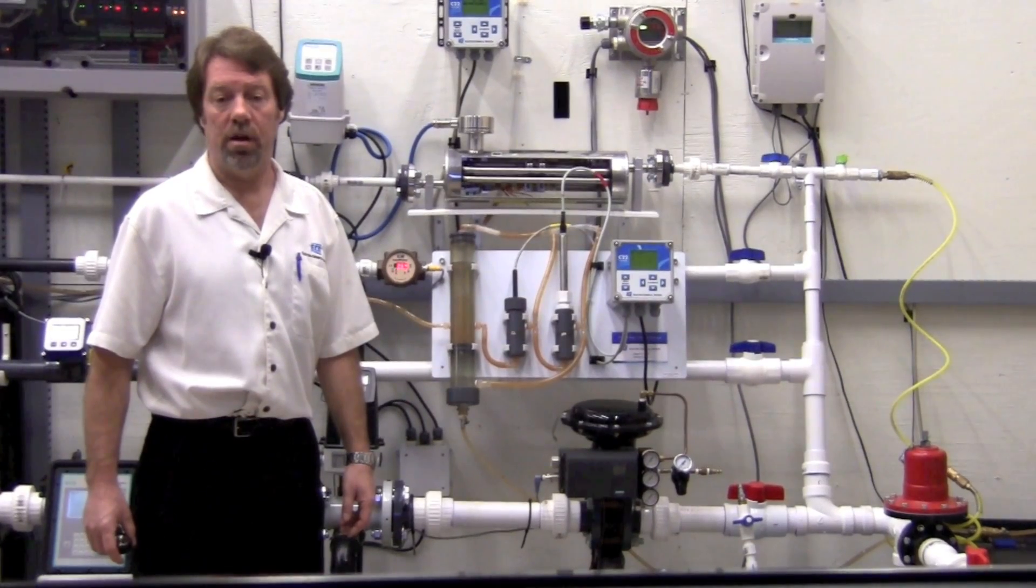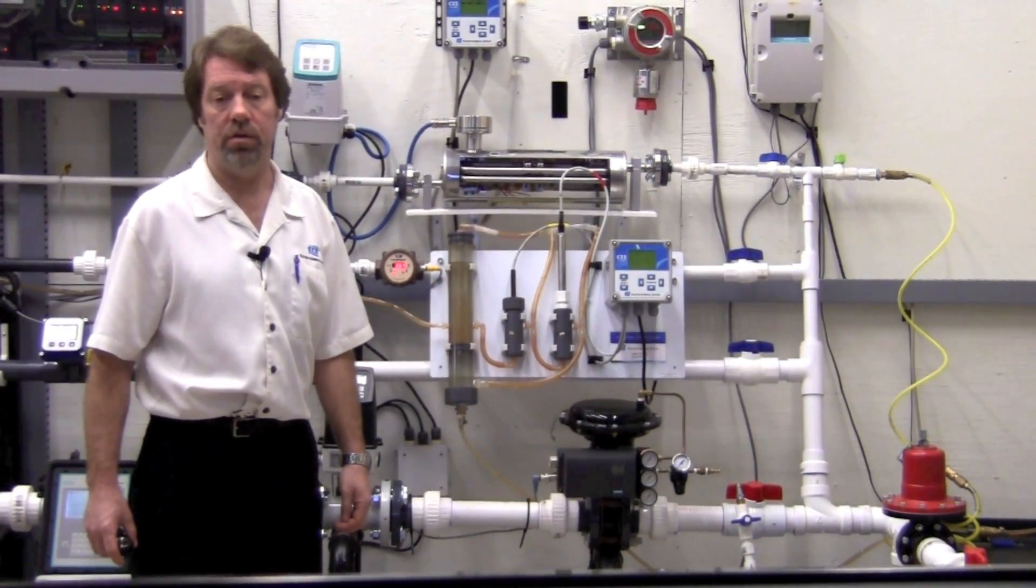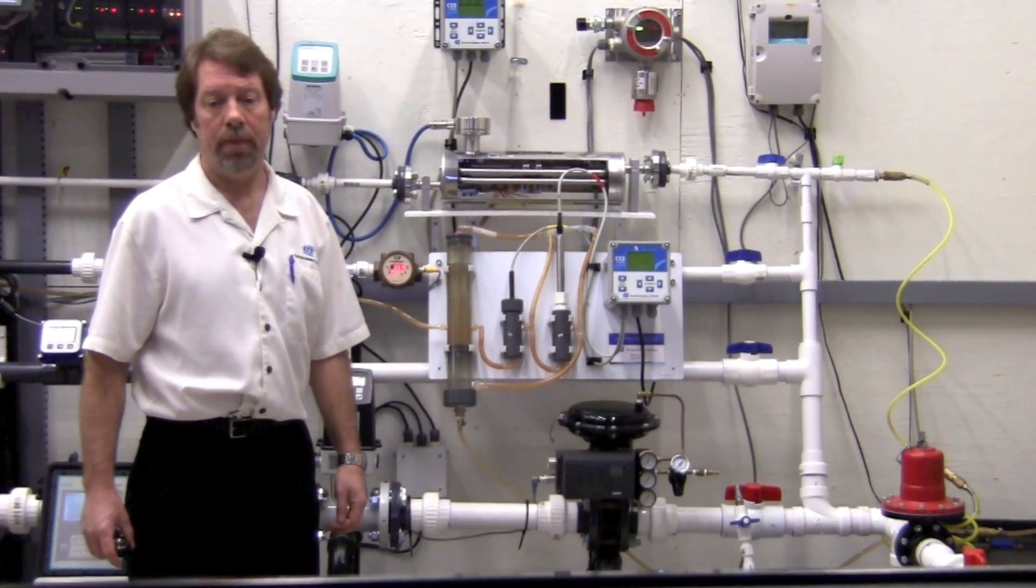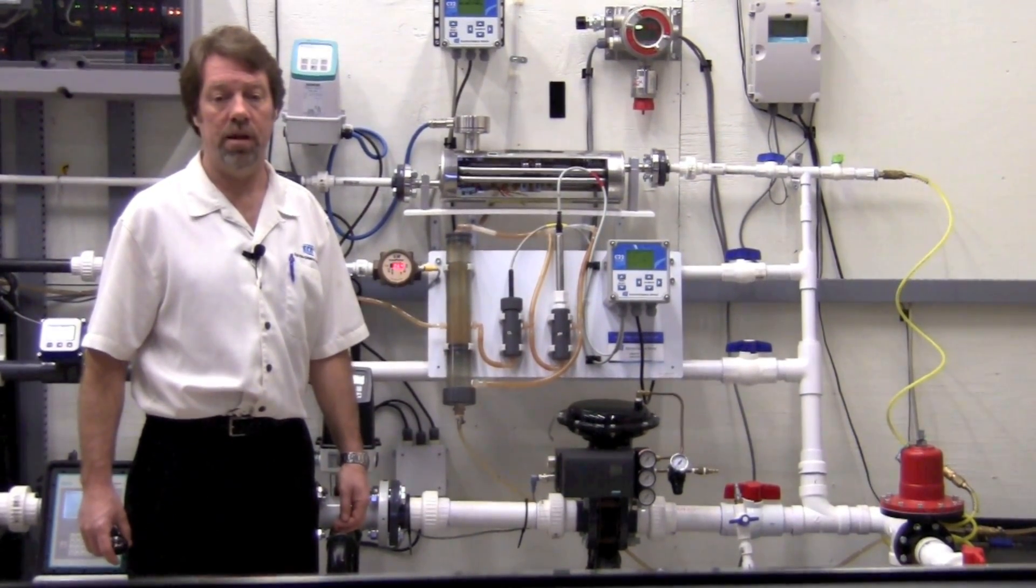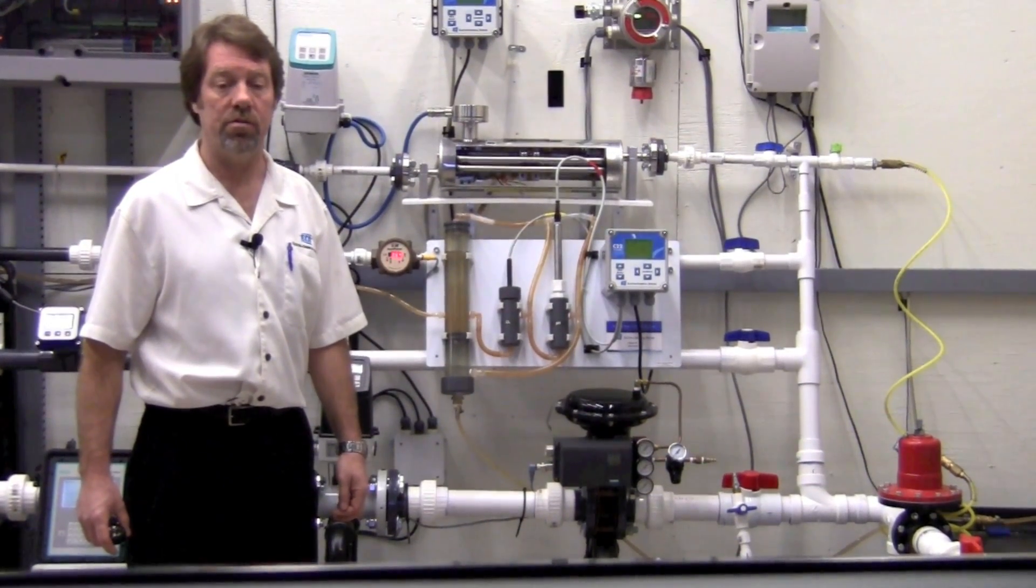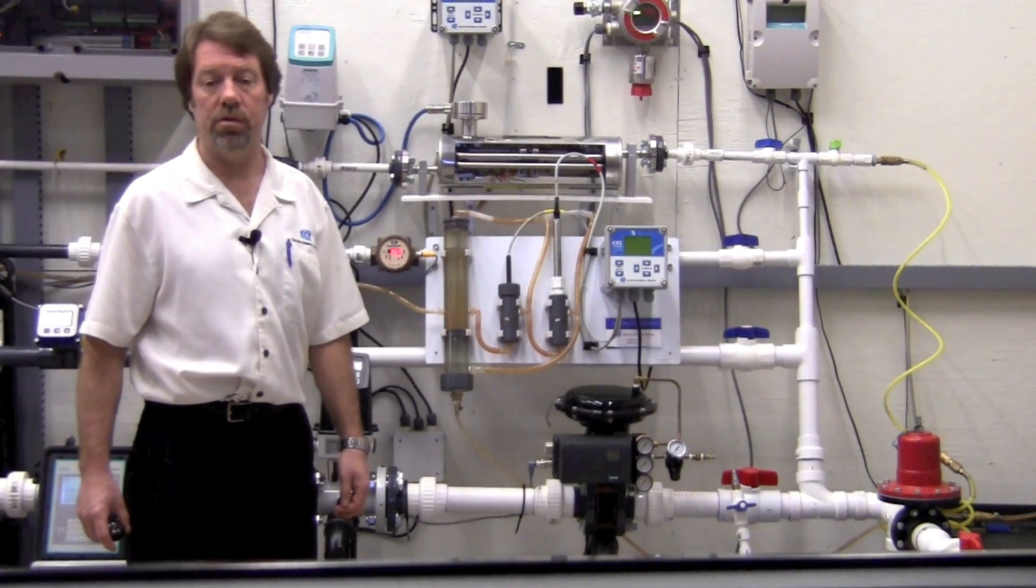The routine maintenance of the ECD chlorine system consists of periodic calibration and maintenance of both the pH and the chlorine sensors. The frequency of the routine maintenance is determined by the chlorine sensor being used and the amount of chlorine that's running through the system.